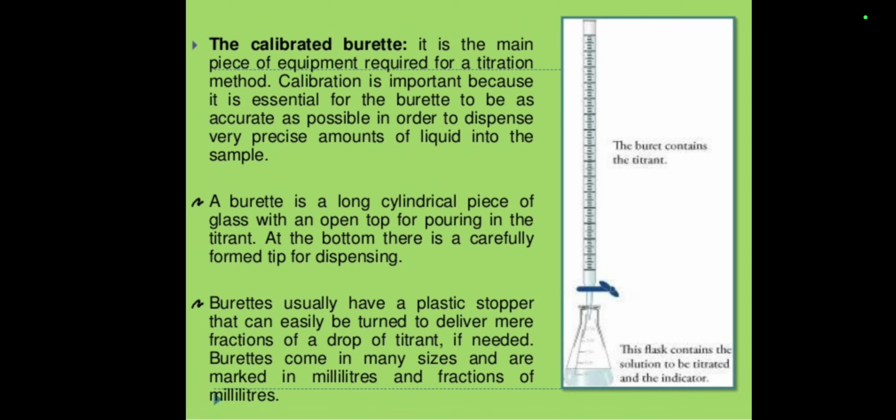Okay. So basically, burettes, as we all know, all have their own stoppers. So we will be the one to manipulate the burettes. As long as you've reached the changing of color, that's where you stop. That's where you use the stopper of the burette. Okay? When adding the solution, it's up to you, as long as you can see the changing of color, either the bad or the good endpoint. That's the time you have to use the stopper of the burette. And that's the time you've already reached the endpoint of the experimentation. I hope you understand what I'm saying.